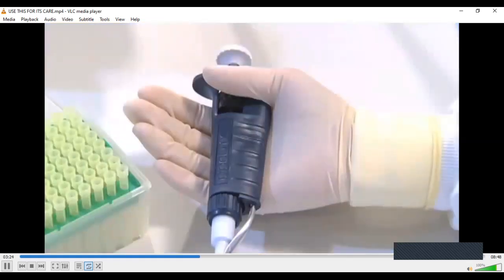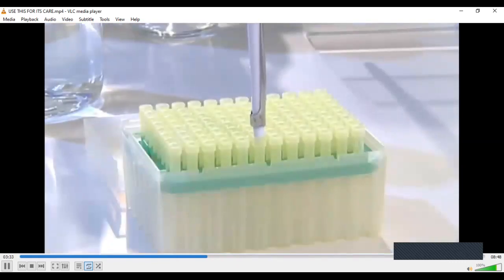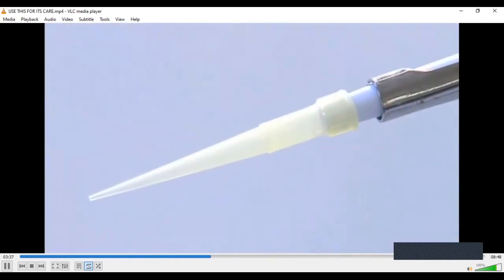Hold the pipette with one hand, with the narrow side resting in the palm of the hand. Add the pipette tip by gently but firmly pushing the pipette into the pipette tip, which is held in a tip box. You may need a little practice to learn to apply the right amount of pressure to give a good airtight seal between the tip and the pipette.